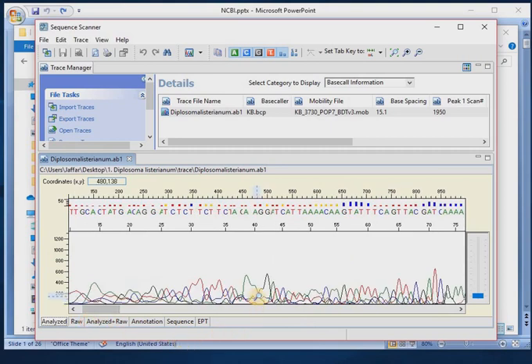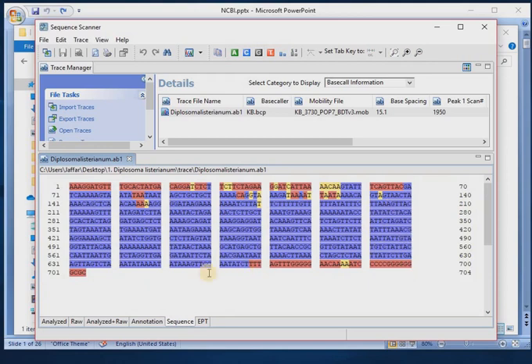You can check the quality in another way. Here, click the sequence this way. This is the quality of the sequence that you can see here. As I already told you, the first few peaks were poor in quality because of the overlapped peaks. You can see the poor quality sequences for the first 100 base pairs. Red colored base pairs show poor quality, yellow is somewhat normal quality, blue is good quality. You can see the quality value, 11 here. Here 52, here 55. More than 50 is good quality sequence, QV, quality value. You see yellow, this 15, right? Accordingly you can check the quality.